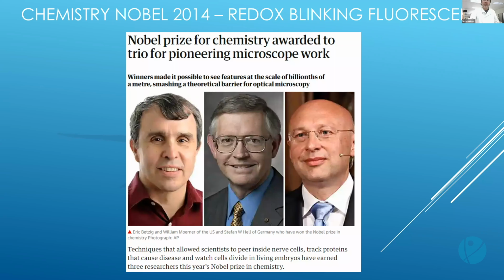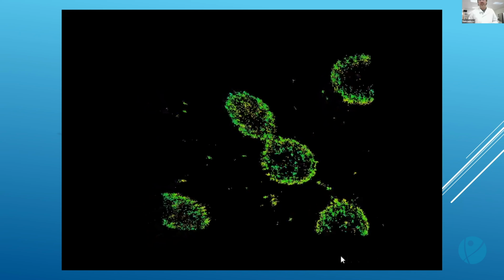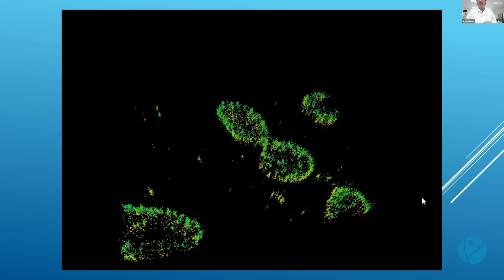So recently, we have had a new type of microscope. And this microscope that we're using is called dSTORM fluorescence microscopy. What you're looking at right here is antibodies to the surface of a mitochondria. And this is a mitochondria moving around in 3D. Now, this is the kind of data the world has been waiting for. This is when you're starting to look at very, very small particles with confidence, without an electron microscope.